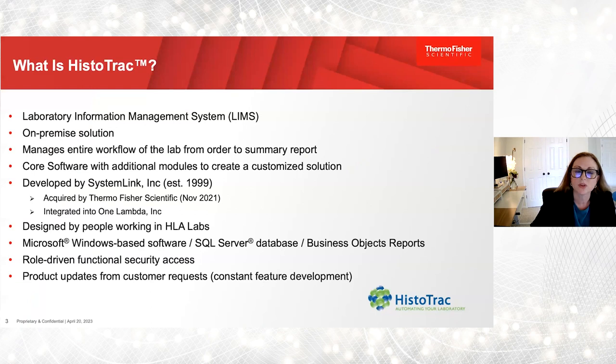So what is HistoTrac? HistoTrac is a laboratory information management system, so it's a LIMS, and it's probably a common word that most of you have heard of lately, at least. It is an on-premise solution, and so what that really means for you all is that you control your data. It is stored in your environment. It is not housed anywhere else other than in your environment.